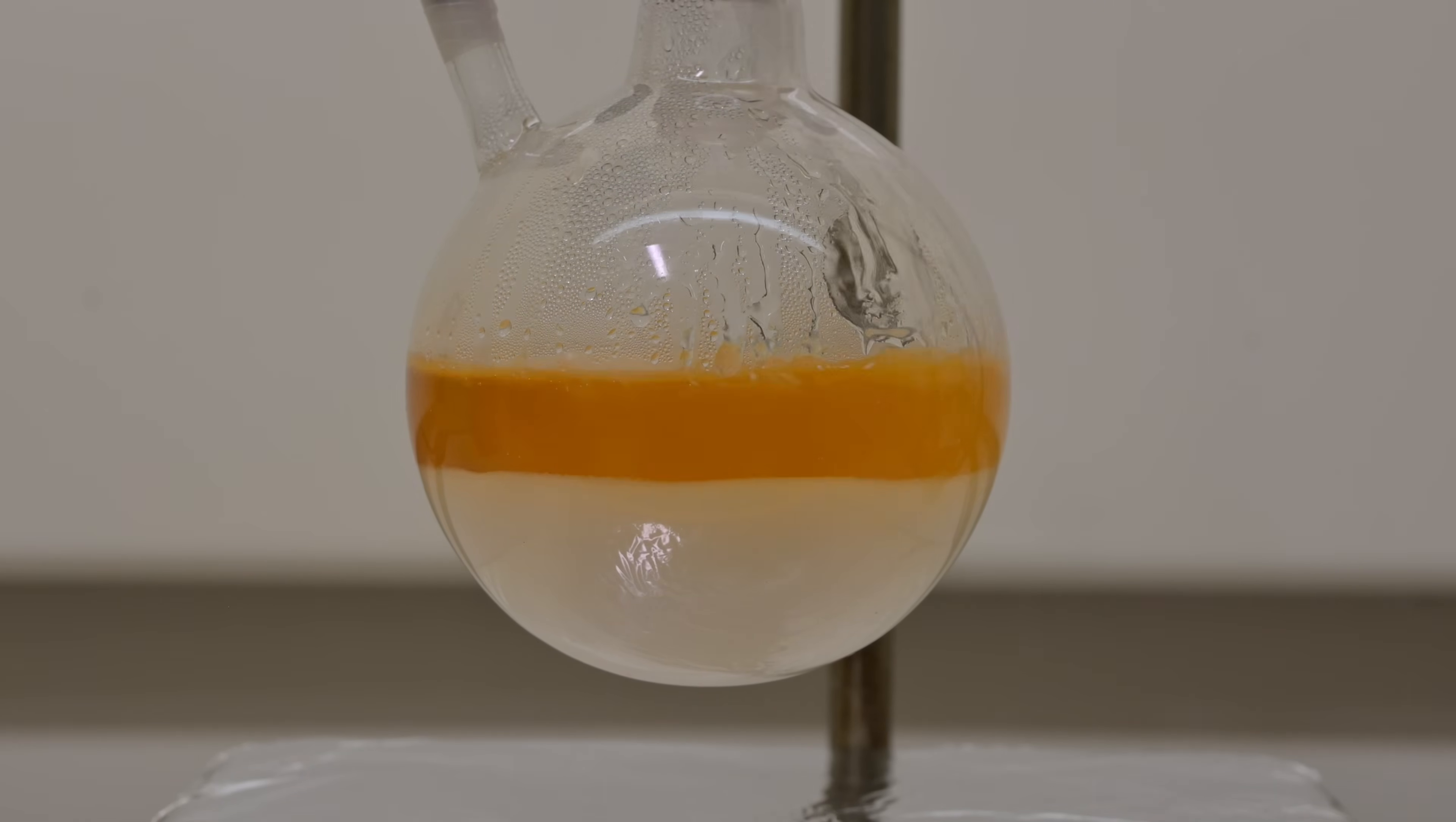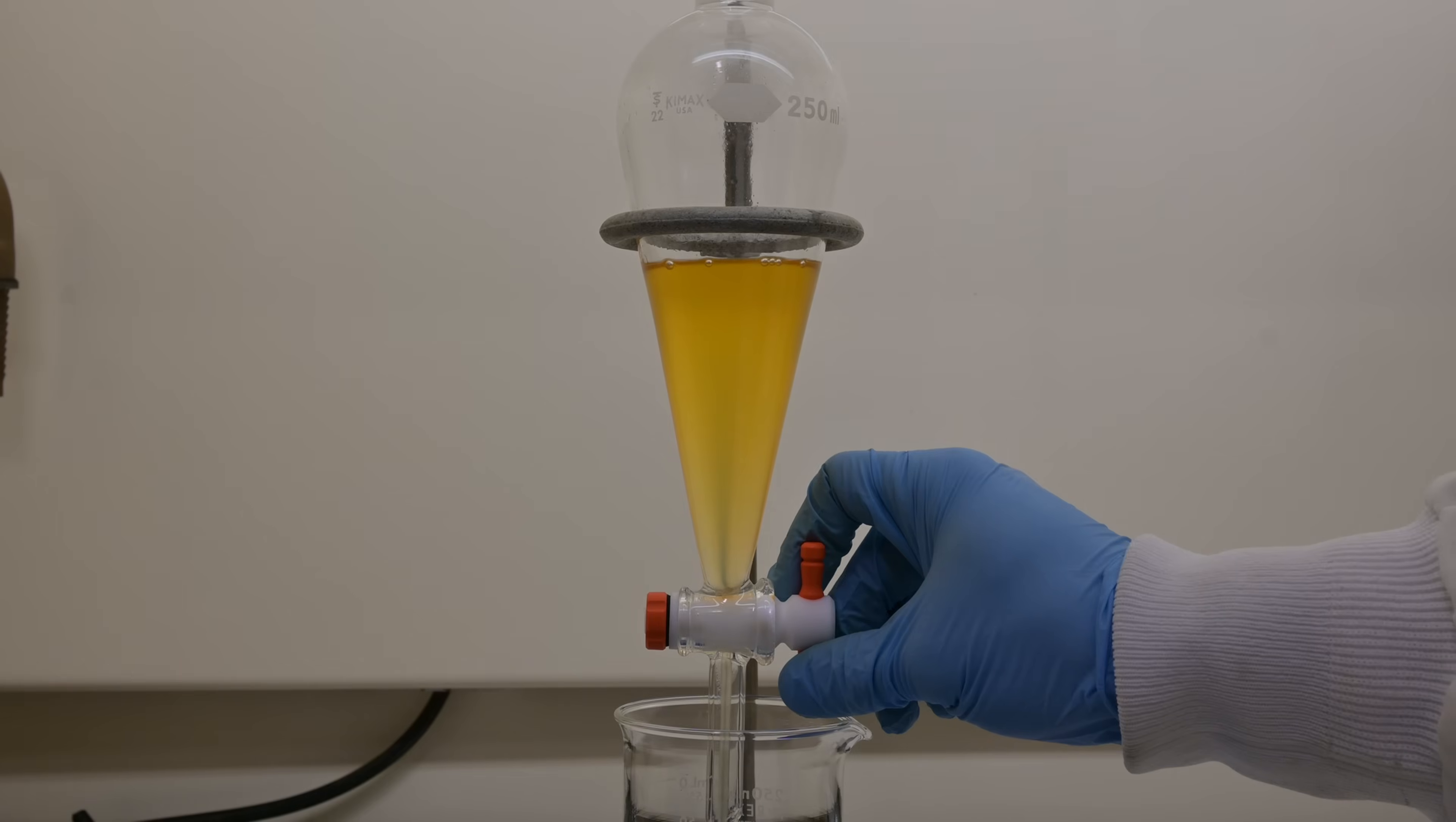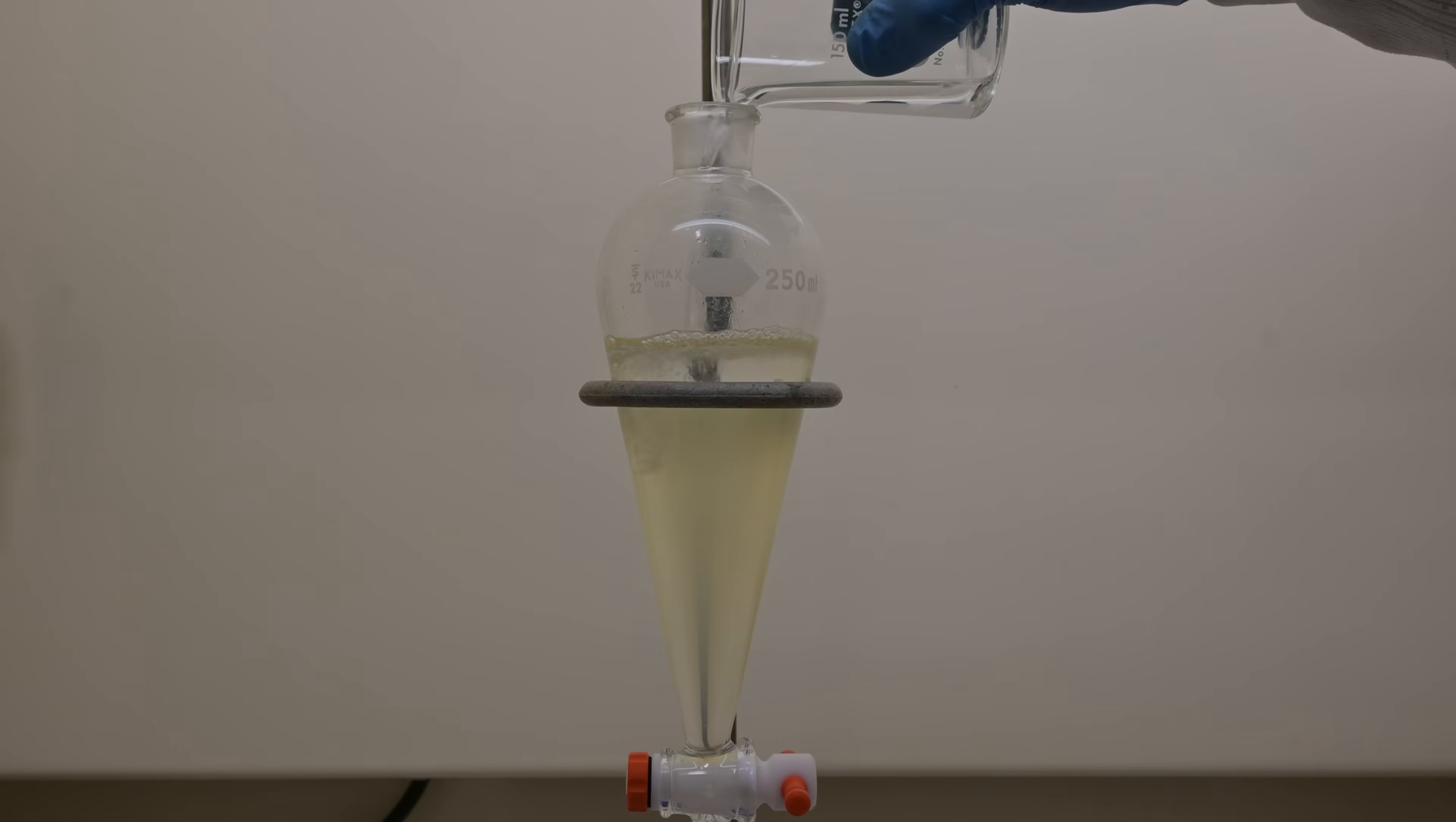Then I pour in about 50 milliliters of benzene and begin a liquid-liquid extraction. Benzene selectively pulls the organic diethylaminoethyl alcohol into its layer. I stir the mixture mechanically for about 5 minutes to ensure thorough mixing and good phase contact. I separate the benzene layer using a separatory funnel and repeat the extraction three more times, each with fresh 50 milliliter portions of benzene. This ensures that I've pulled out as much of the product that I can from the aqueous phase as possible.